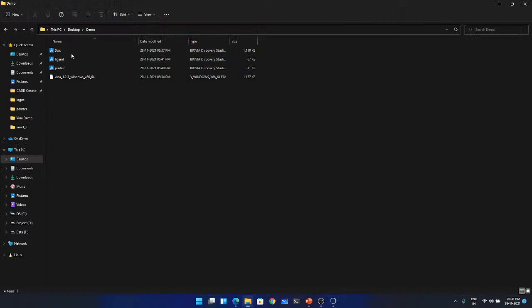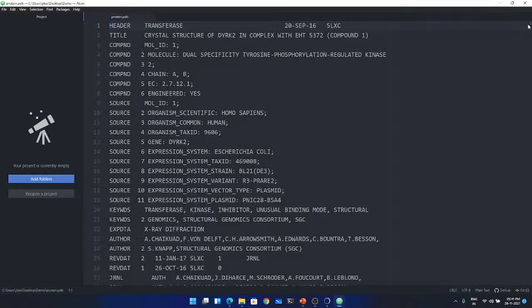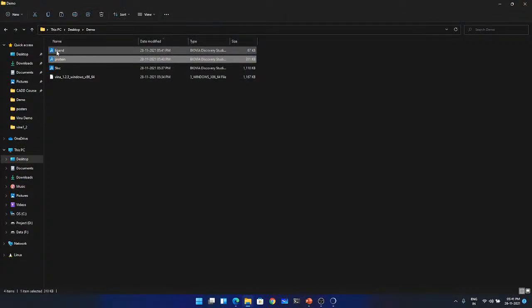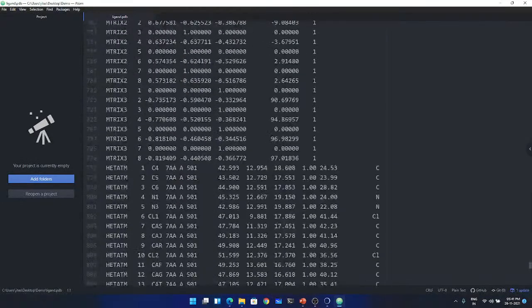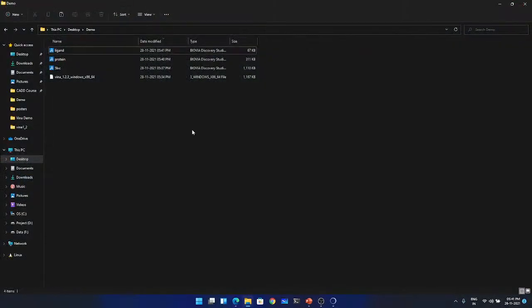If you check the newly generated files, we have a protein PDB file which only contains the protein coordinates of different amino acids. Again, as I mentioned, I am not discussing the preparatory steps, so I'm not going into details of things like sanitization and all that. And this is the ligand molecule which only contains the heteroatoms. That means we have successfully separated the protein and ligand.